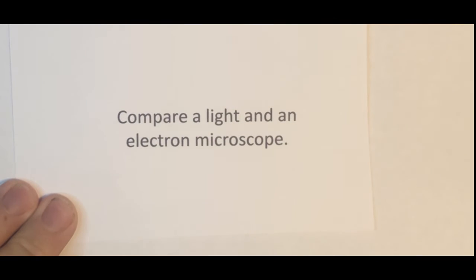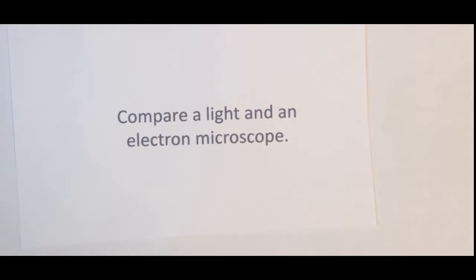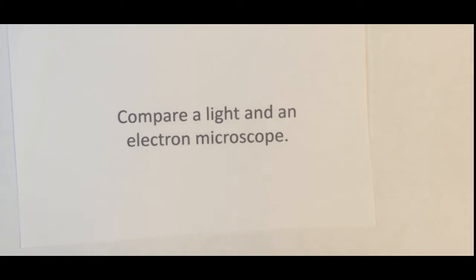In this video, what we're going to be looking at is comparing a light and an electron microscope. In the previous video, we talked about a light microscope. If you just take a look back, it goes through all the different parts of a light microscope. Now, an electron microscope is absolutely incredible.